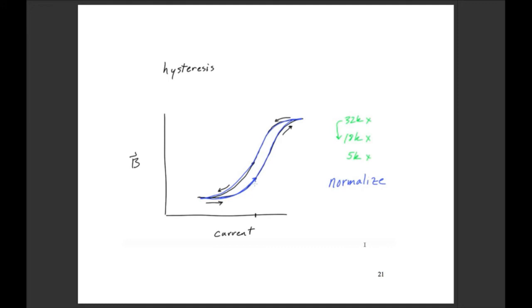He talks about hysteresis. This is a word that's thrown around pretty regularly in EM. What it means, and this is the first time I actually learned a definition of it, is this: in this XY diagram, you have the magnetic field of your lens, and the current that you apply to your lenses.